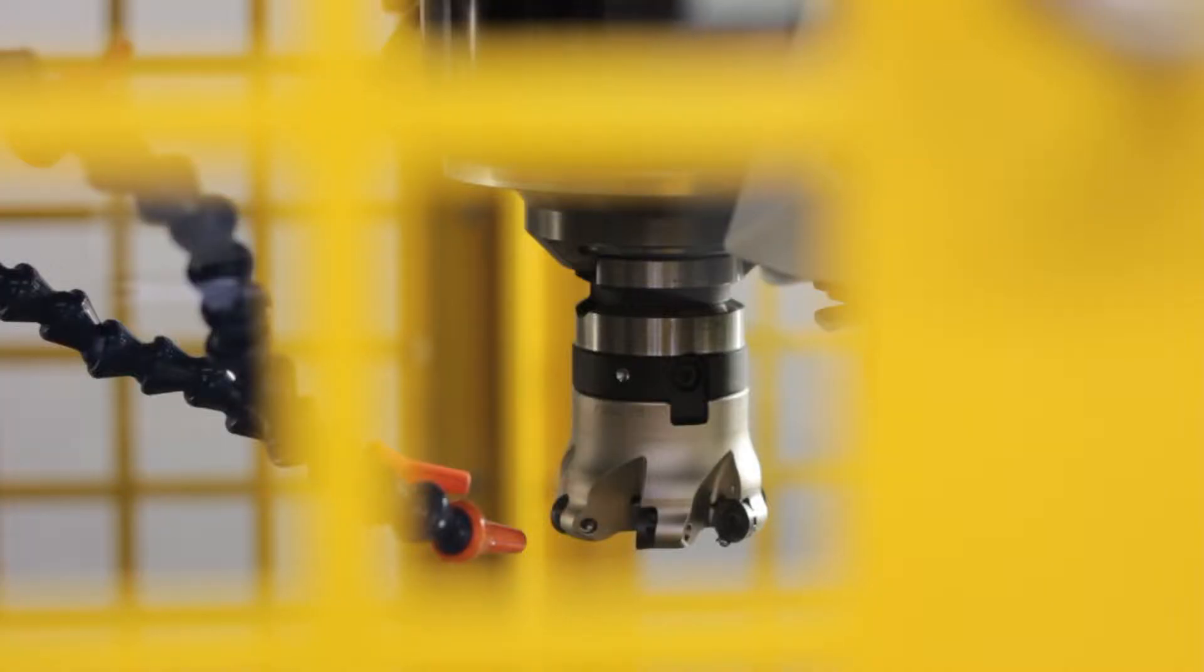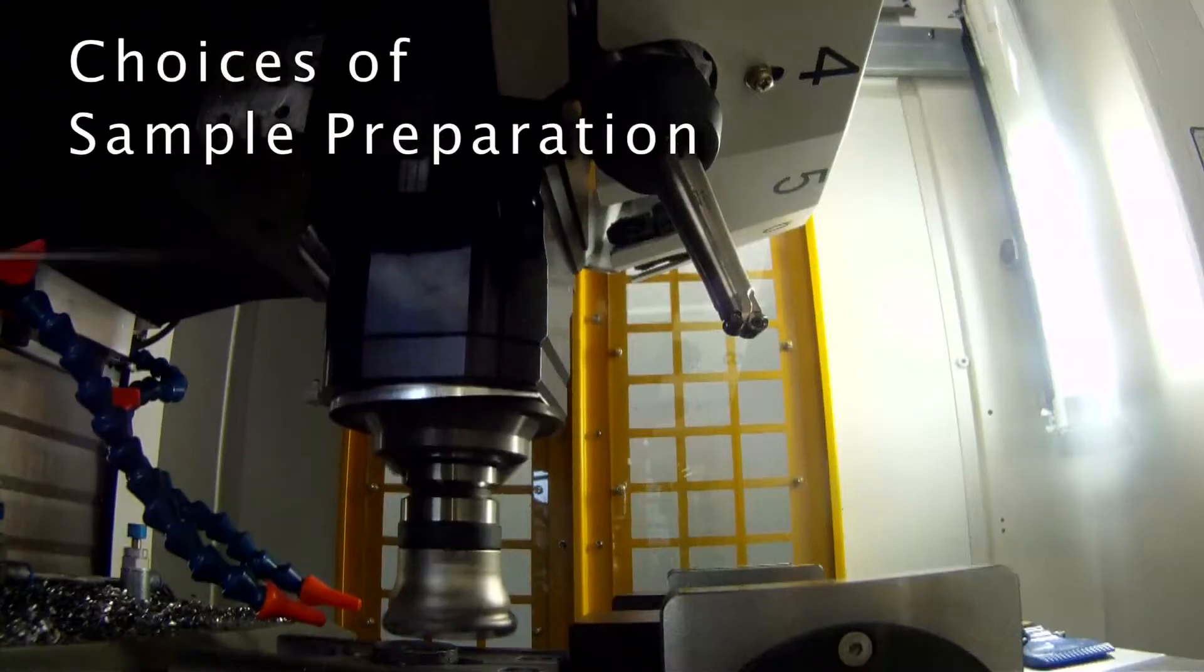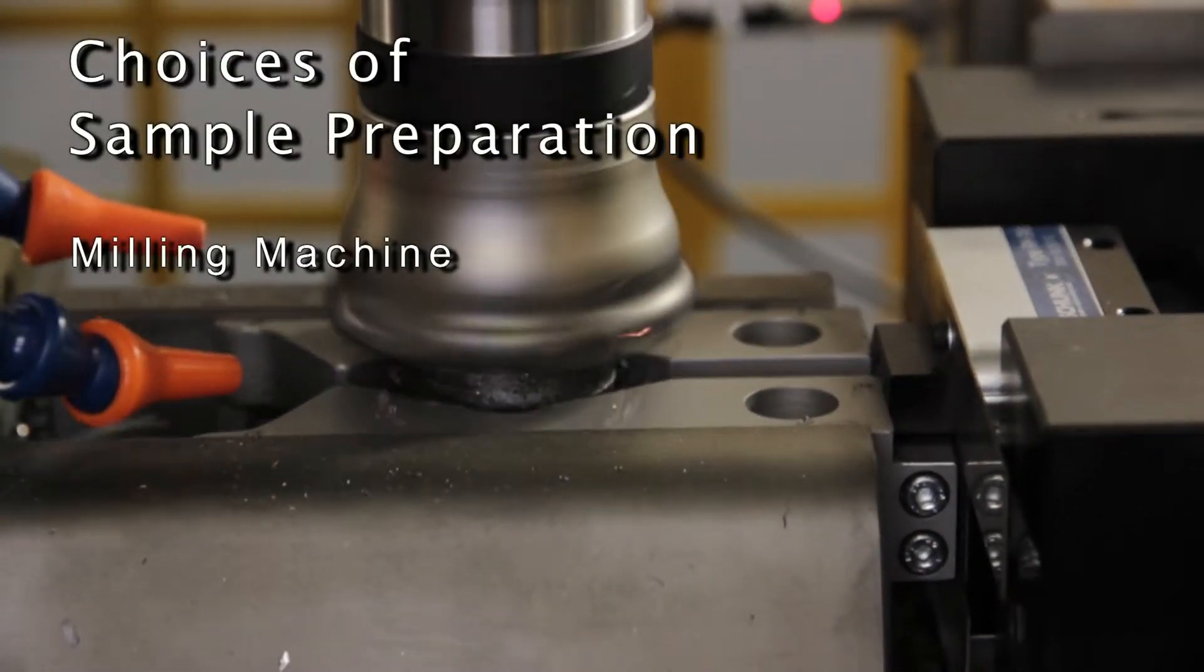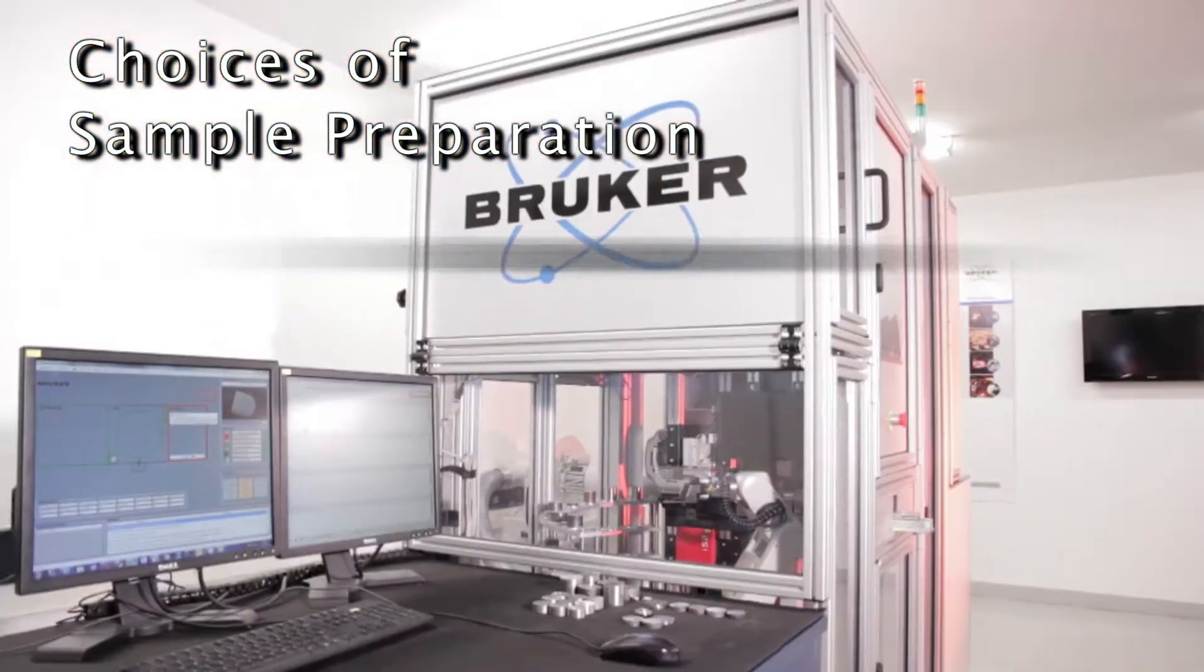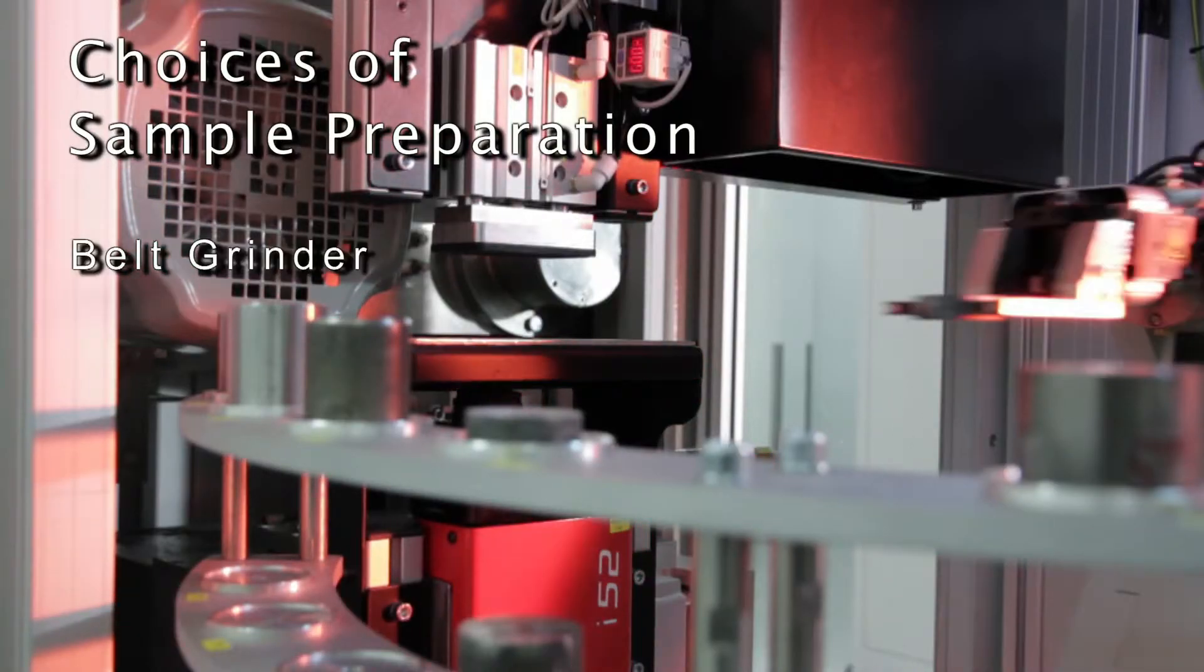It's your choice of sample preparation: an advanced milling machine for the preparation of steels and non-ferrous metals, or a high-performance belt grinder for the preparation of steels and cast iron.